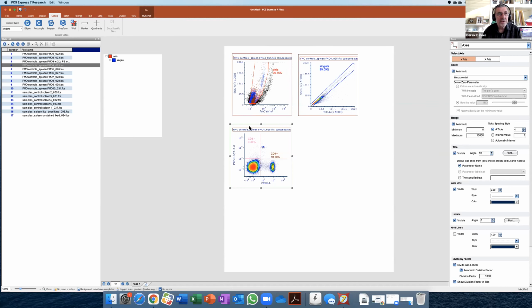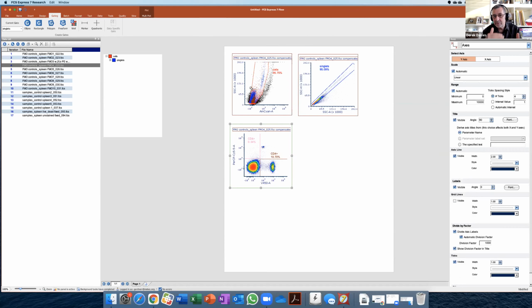Or you could, as you say, set it to always be 0.1% or 0.5% or something like that. But even that's not ideal. As you say, if you're looking for a rare event, that's going to confound your statistics a bit, isn't it? Exactly. And your belief in that result.